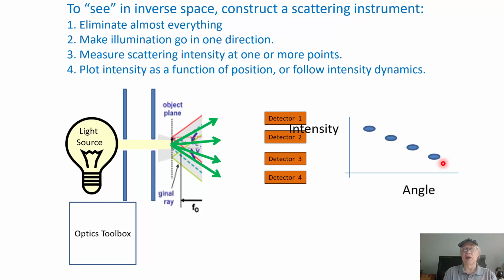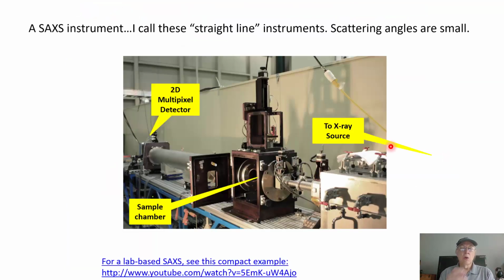As a matter of fact, we have to actually choose certain angles and certain wavelengths in order for this intensity to go down enough to be seen. Okay, so this is a SAXS instrument, and this one is one that we built at LSU. It's been dismantled now and reassembled. It works even better with new cameras and other things on it.